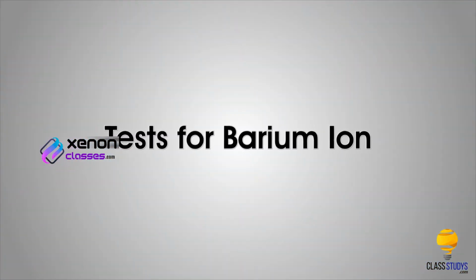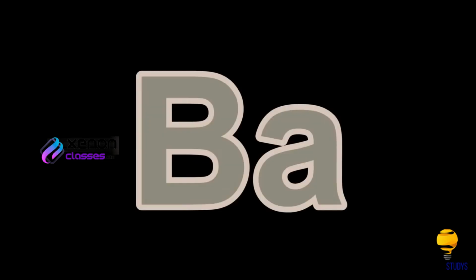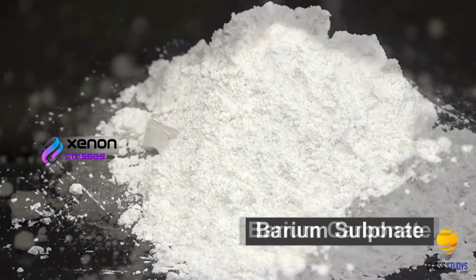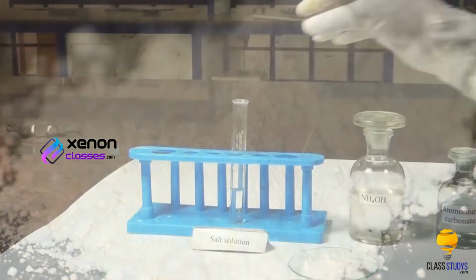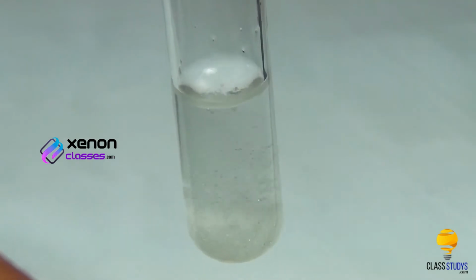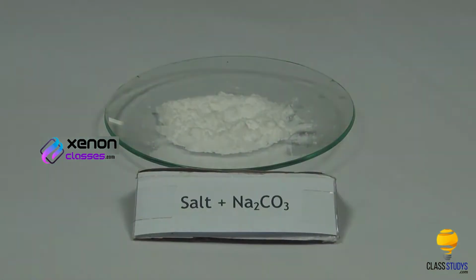Tests for barium ion. Barium is a chemical element with symbol Ba. It is found in various salts like barium nitrate, barium sulfate and barium carbonate as barium 2 positive ion. In group 5, barium ions are precipitated as their carbonates by adding ammonium carbonate to their solution. Our aim here is to test for the presence of barium ions in a given salt.